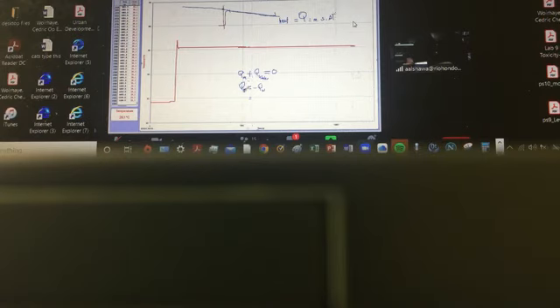So that means Q for the metal should have in it the mass of the metal, specific heat of the metal, delta T for the metal. Okay, so let's write them down. I'm going to write down all three terms that belong to the metal, which is the mass of the metal. What's the mass of the metal? What was it? I measured 49.41. 49.41, right? So 49.41 grams.